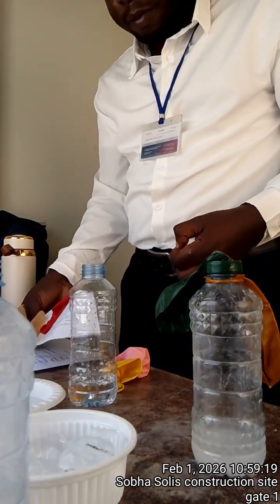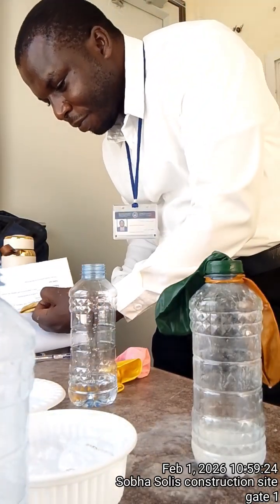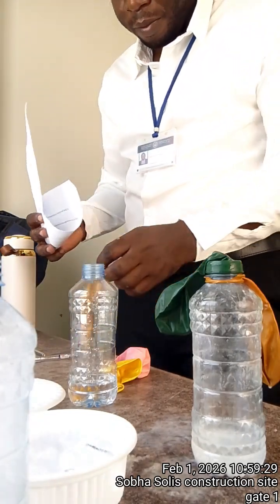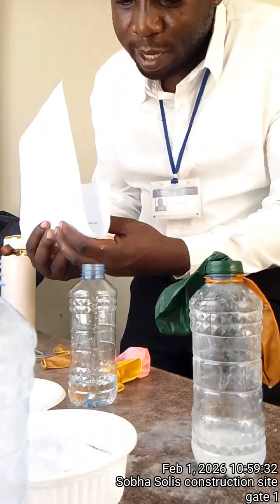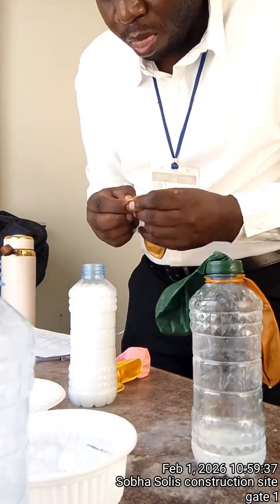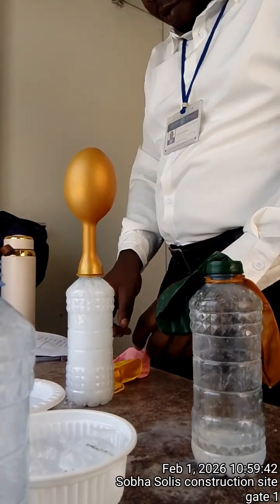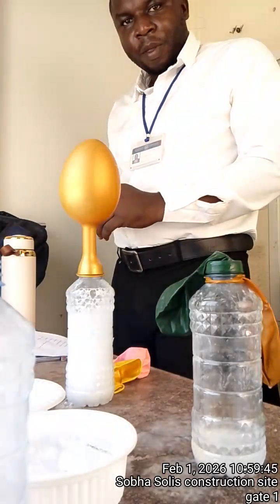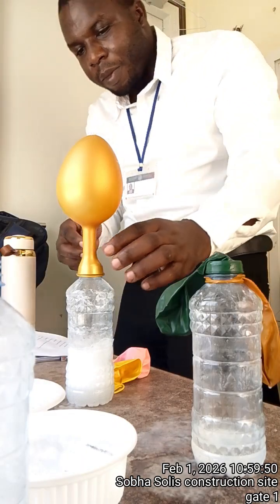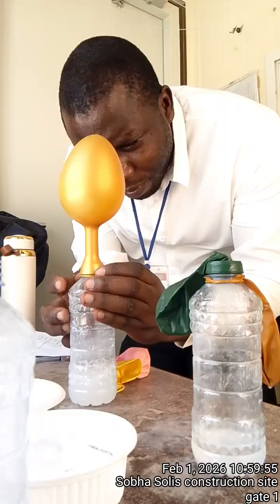Okay, members, this is my practical, and things are not running on my side very well, but here we go again. We are the science, we don't give up. So we got the first bottle. I'm going to repeat for the other bottles.